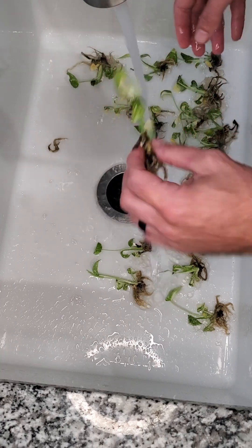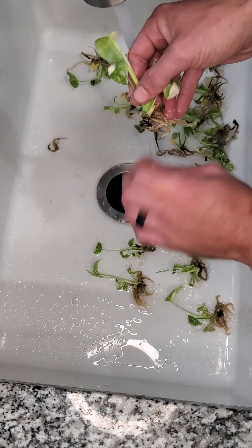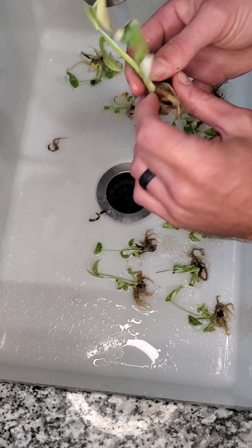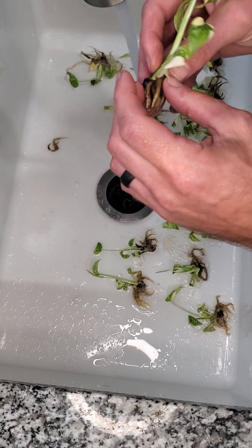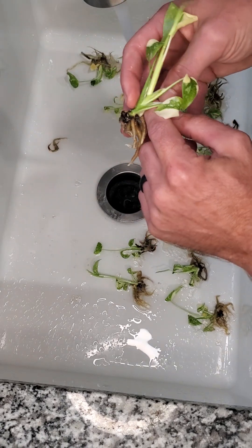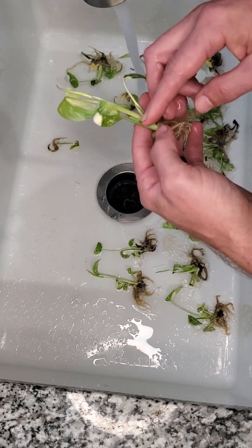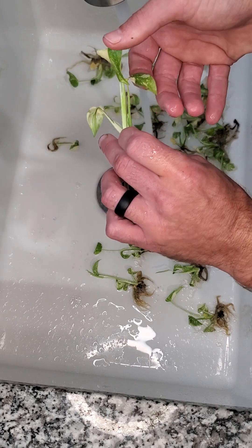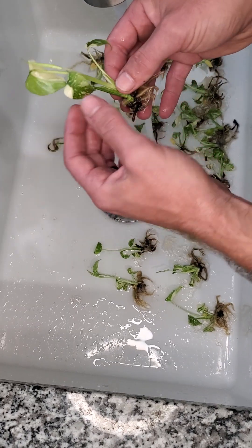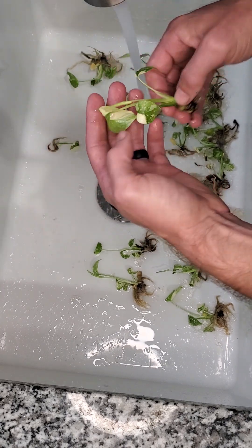Once I get the bulk of the gel off, I'll start with any loose foliage — anything that comes off easily. I'll peel it down away from the top of the plant. Even this leaf is very healthy, but you can see it has an aerial root coming out from behind it, so that leaf is going to fall off eventually anyhow, so I go ahead and just take it off. The rest look pretty good.